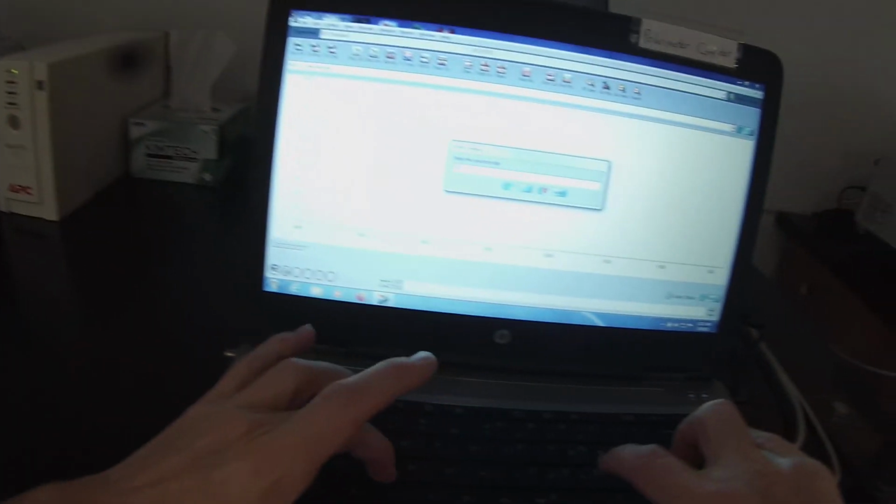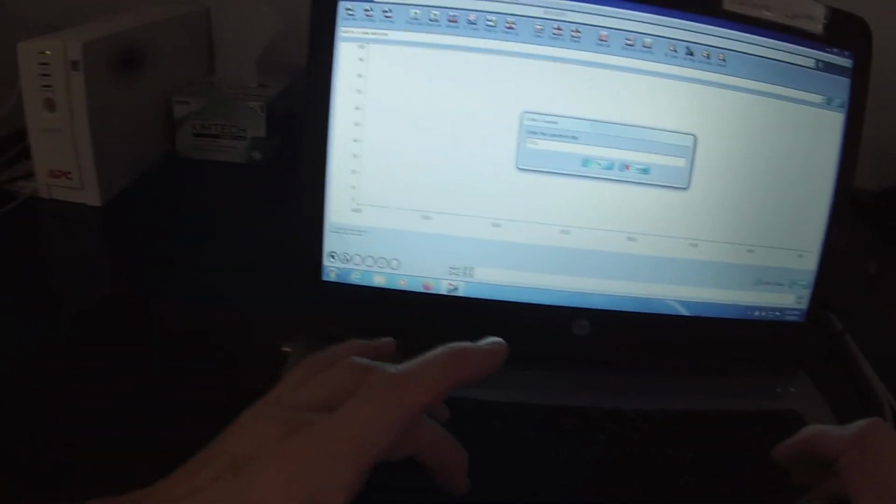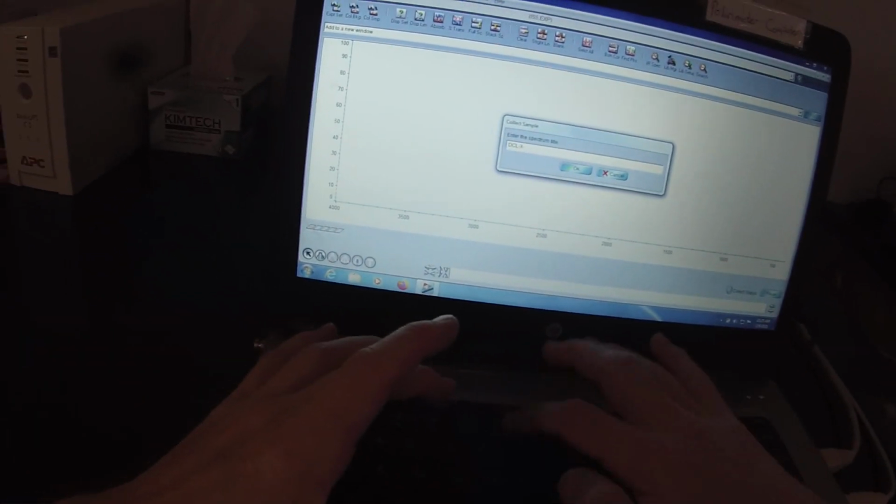And this is DCL-10. V-66B dash, I think 1 and 2 were both the GC mass spec, so I think this is 66B-3. Okay, that. So I ran the GC mass spec under 2 different methods.